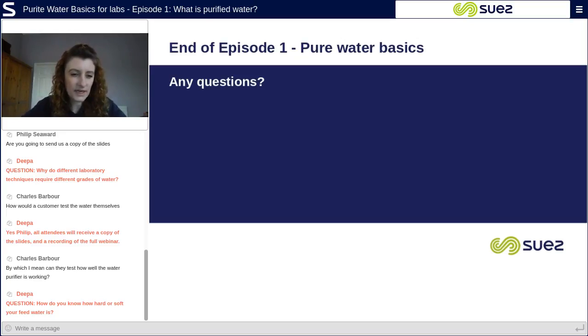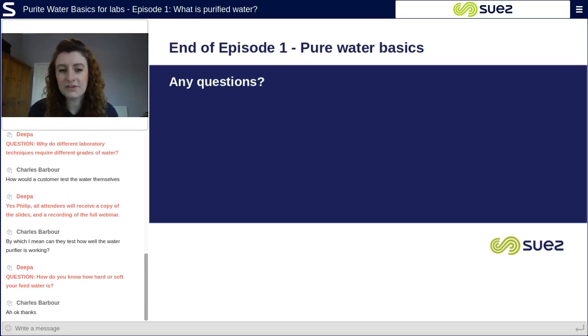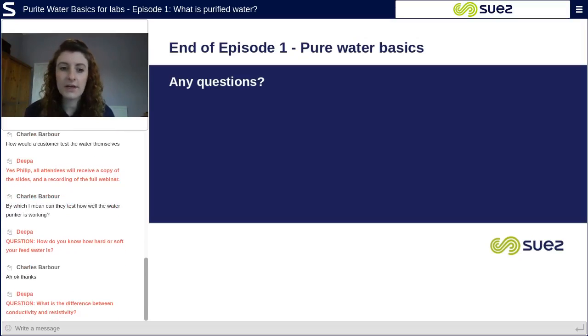Another question there: how do you know how hard or soft your feed water is? I just mentioned that before. You can submit feed water samples for analysis, which we can help you with, or there might be local laboratories in the area that do this kind of function. Or again, you can look online at your water company provider, and they usually have data on their website.